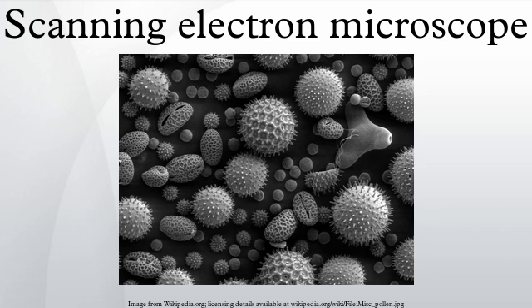ESEM may be the preferred method for electron microscopy of unique samples from criminal or civil actions, where forensic analysis may need to be repeated by several different experts.